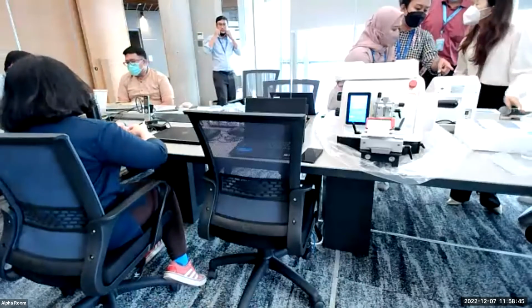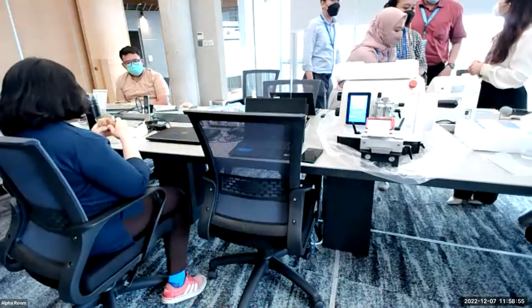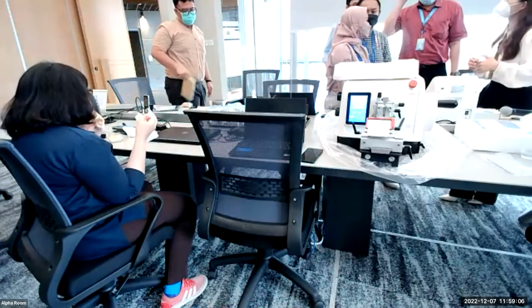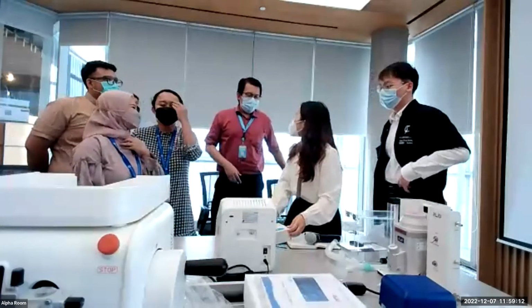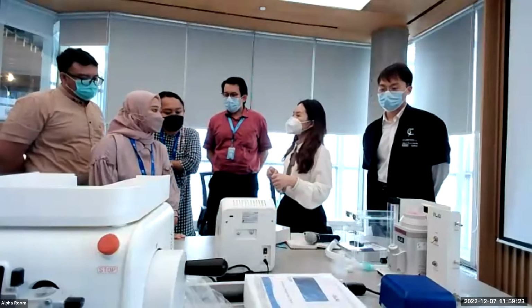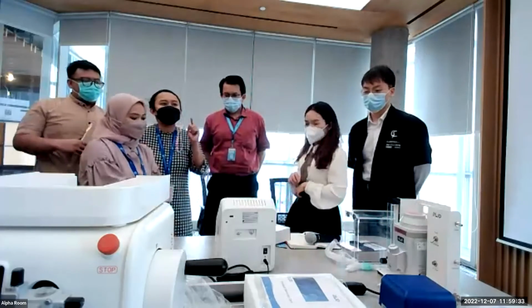Ini just for the red blood cell or what kind of cell can we use in here? The thermal and the nanotech can use all consumable. I mean the cells type. Yeah, cells type. What kind of cells? I mean any cell. Like cell line. Okay. For the machine, most cell line can count. Yeah, most cell line. Okay. All kind of cell. Most.